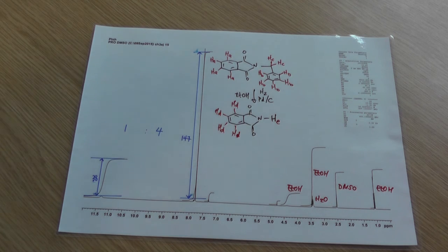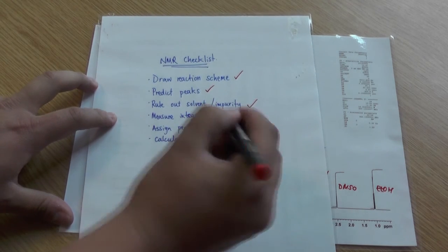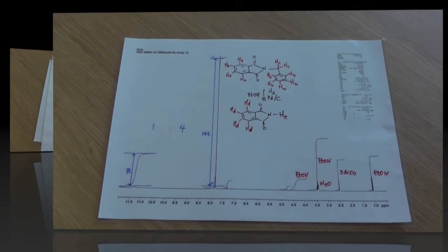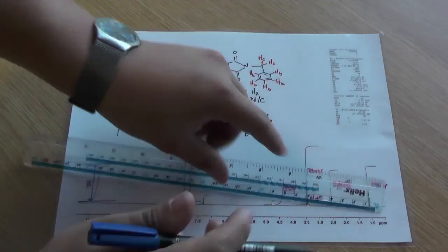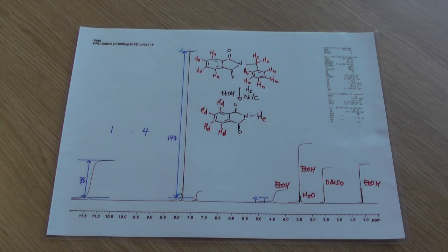Looking back at our checklist, we can now say that we've measured our integrals and we've assigned our peaks. The last thing to do is to calculate the purity of your sample by comparing the ratios of impurities and product in your NMR sample. The way to do this is to measure the integral of an assignable impurity peak. We chose the benzylic peak as it's far away from the aromatic region and we know that it corresponds to two protons. The height of this integral is 4 millimeters. That corresponds to two protons. So now we can work out that one proton corresponds to two millimeters.